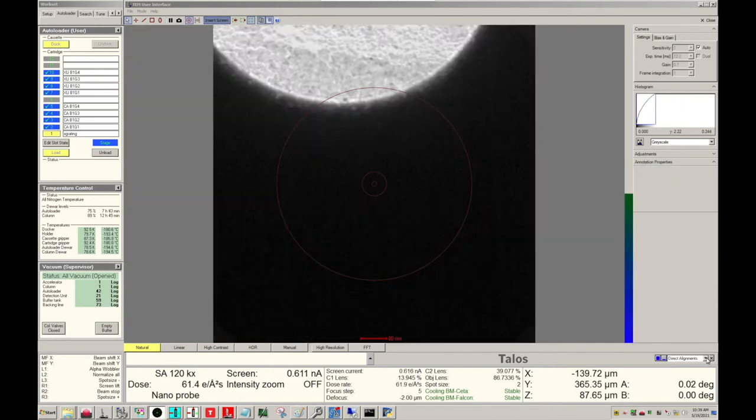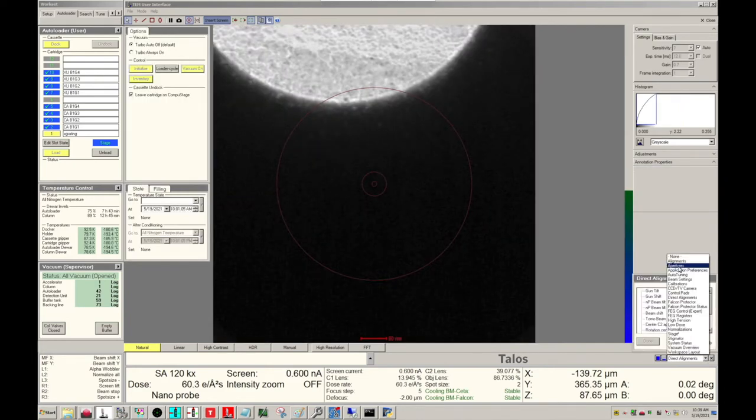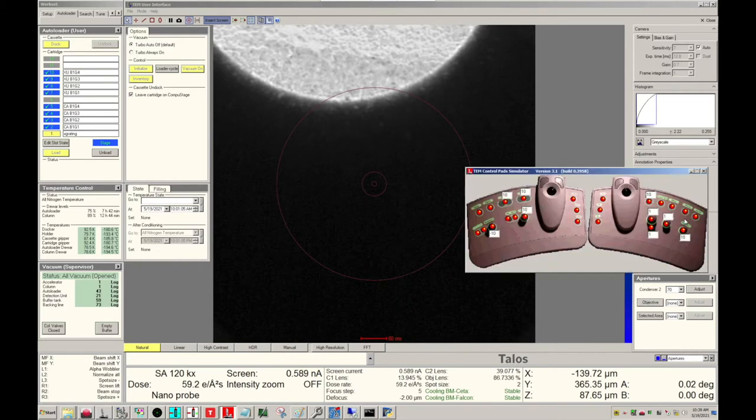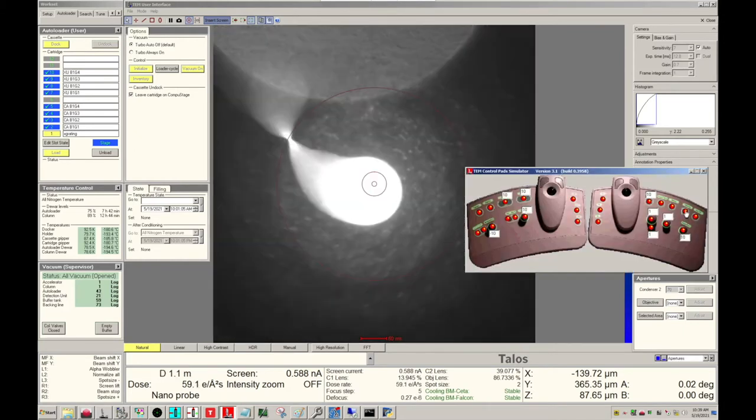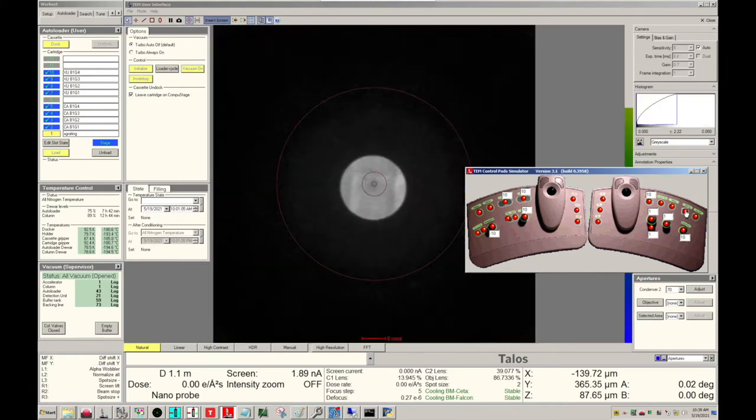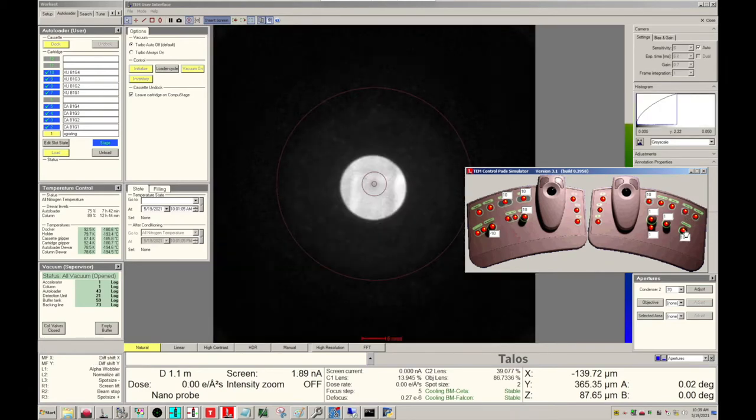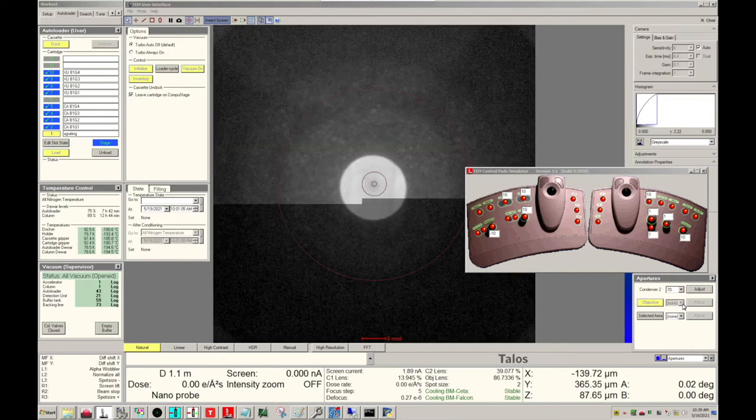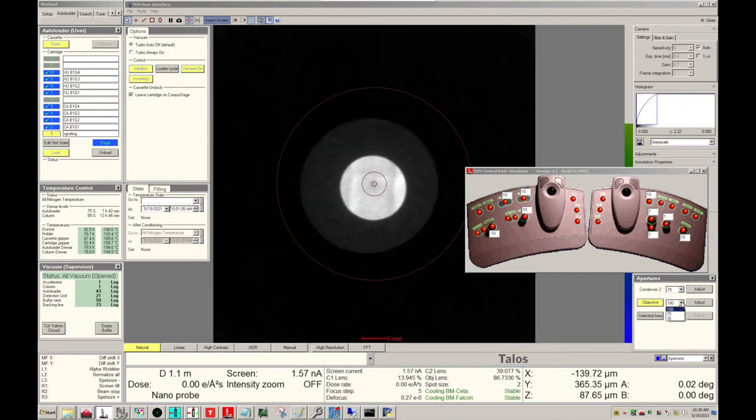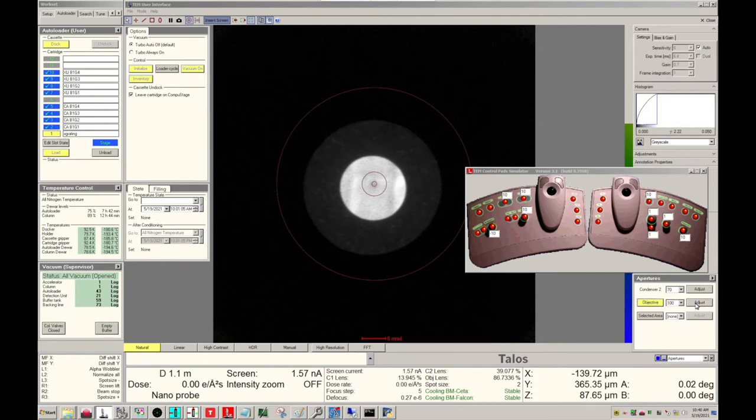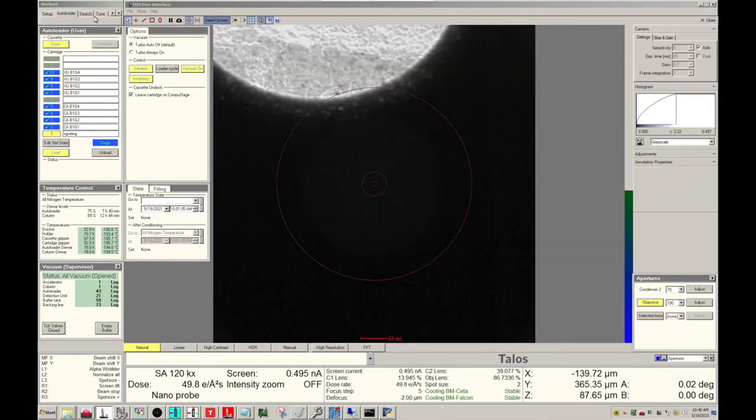Let's go to our Apertures tab. Let's go into Diffraction Mode and insert our Objective Aperture. We want to use 100 microns. If off-center, let's adjust by clicking the Adjust button and using Multifunction X and Y to center the Objective Aperture. Unclick Adjust when done. Now let's come out of Diffraction Mode.